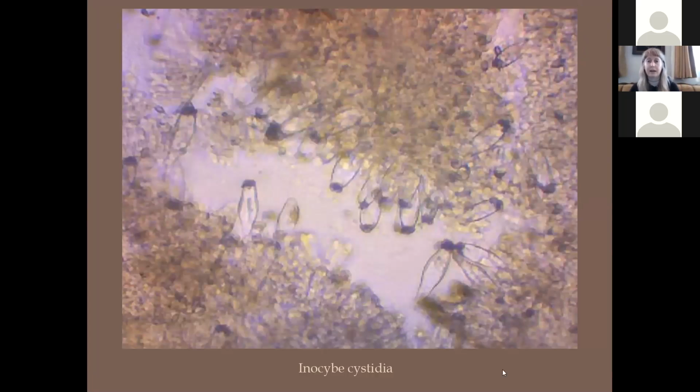Okay, so this is an Inocybe. So you might recognize Inocybe, the genus. Ino is fiber and Cybe means head. So there's a lot of mushroom genus names that are something Cybe because mushrooms look like heads. And when you get it under the microscope, you will see all of these little projections that are coming out, and there are encrustations on the end.